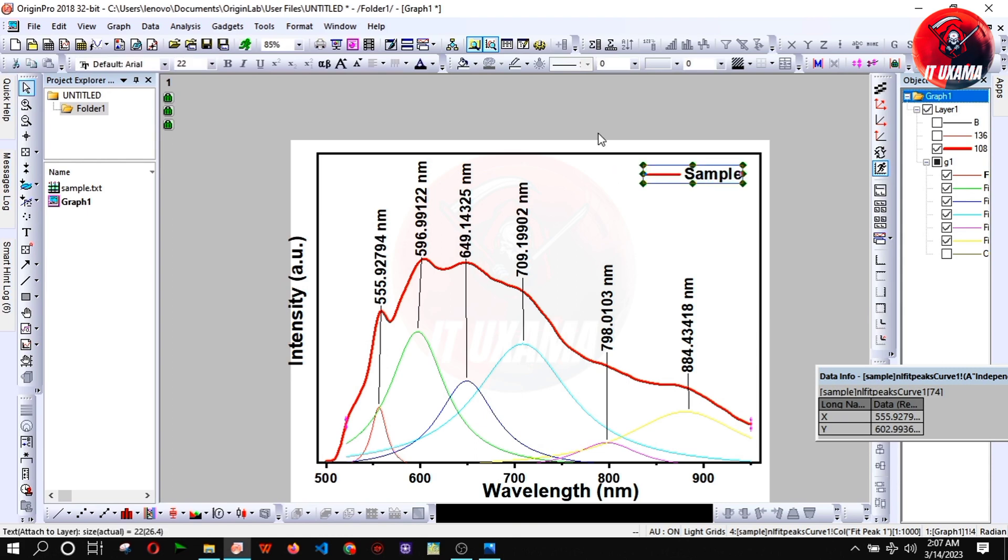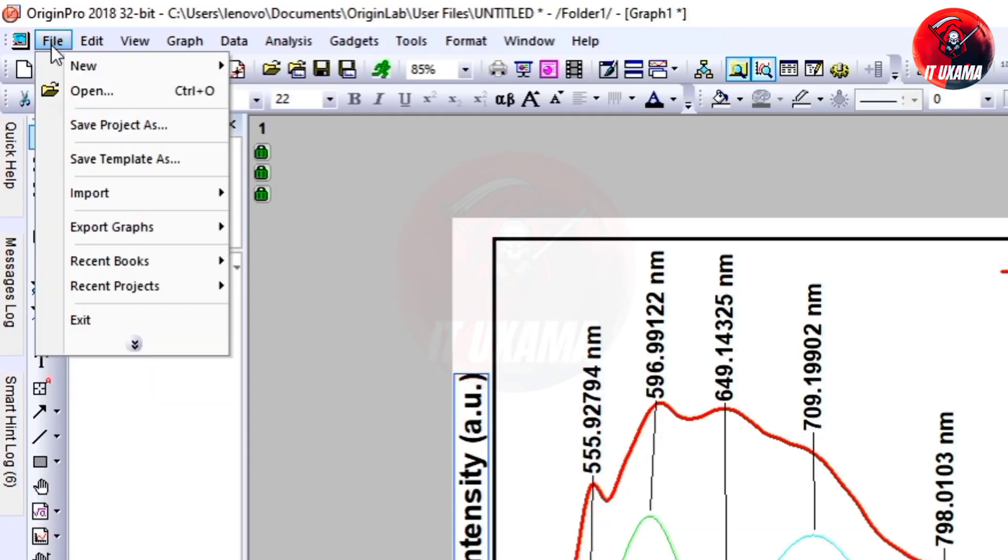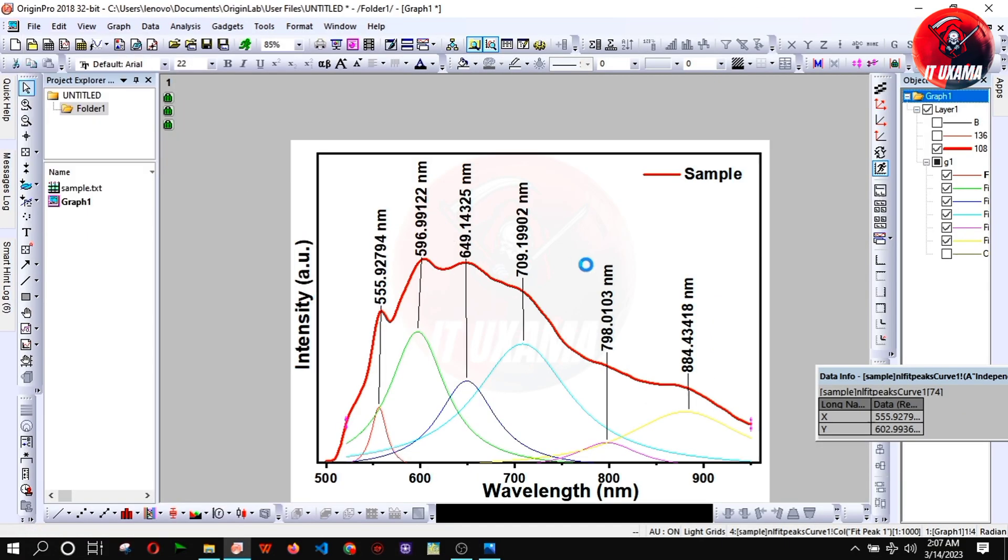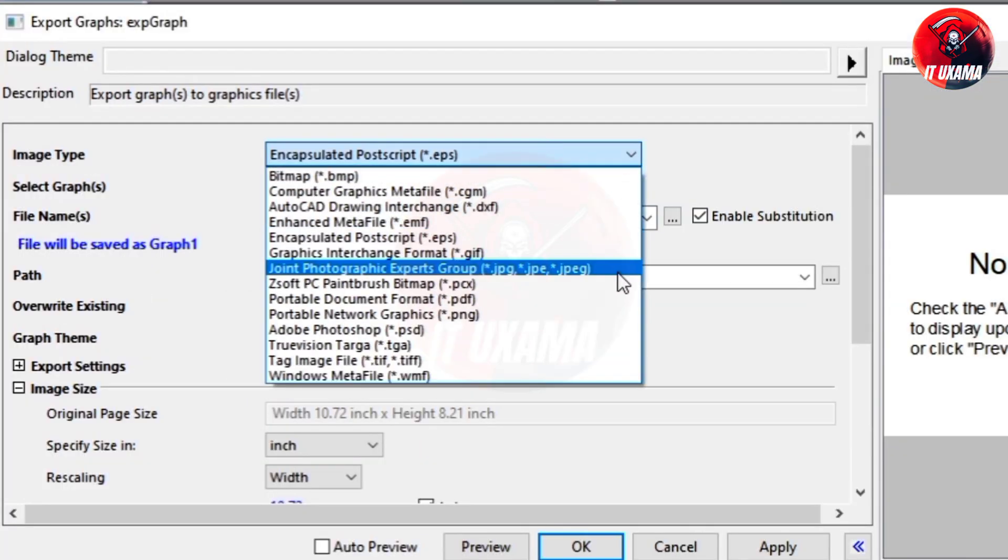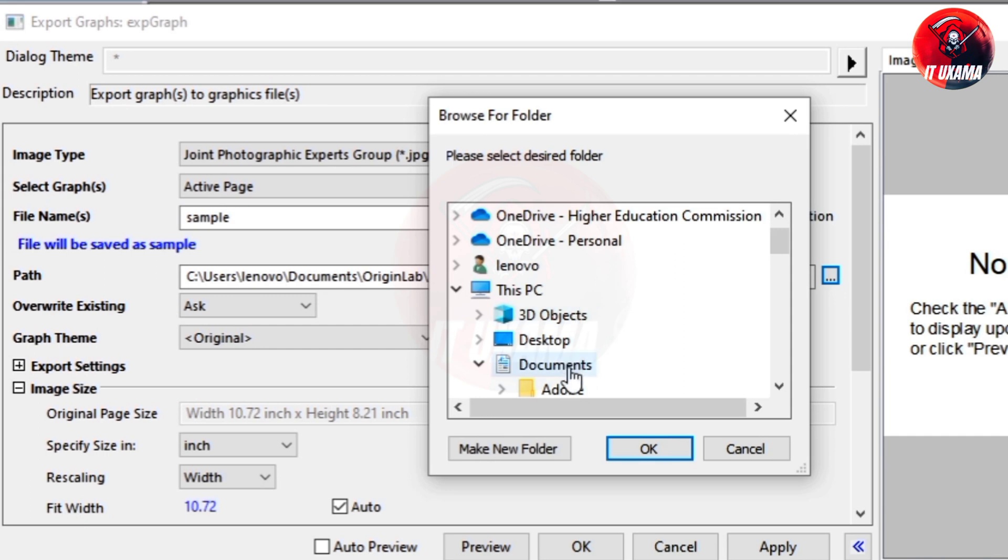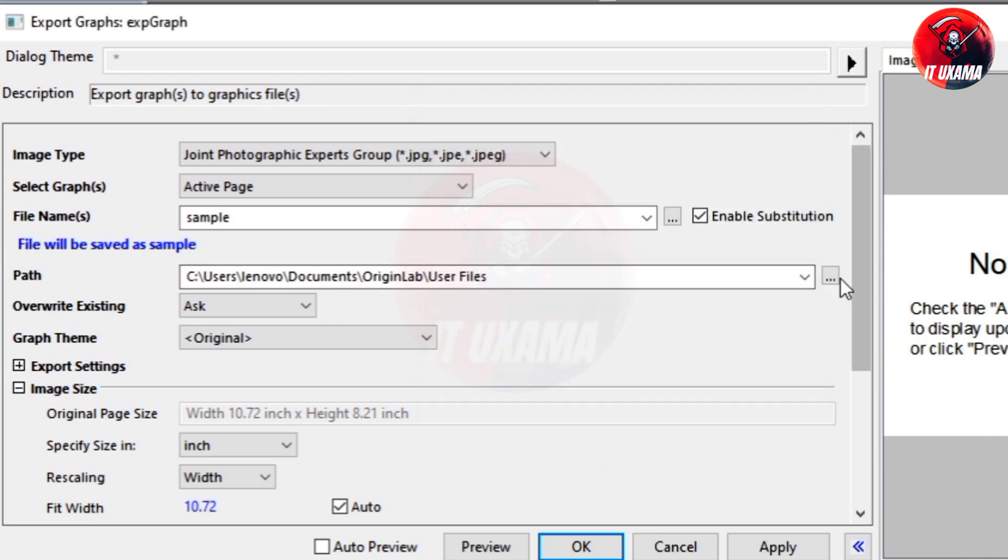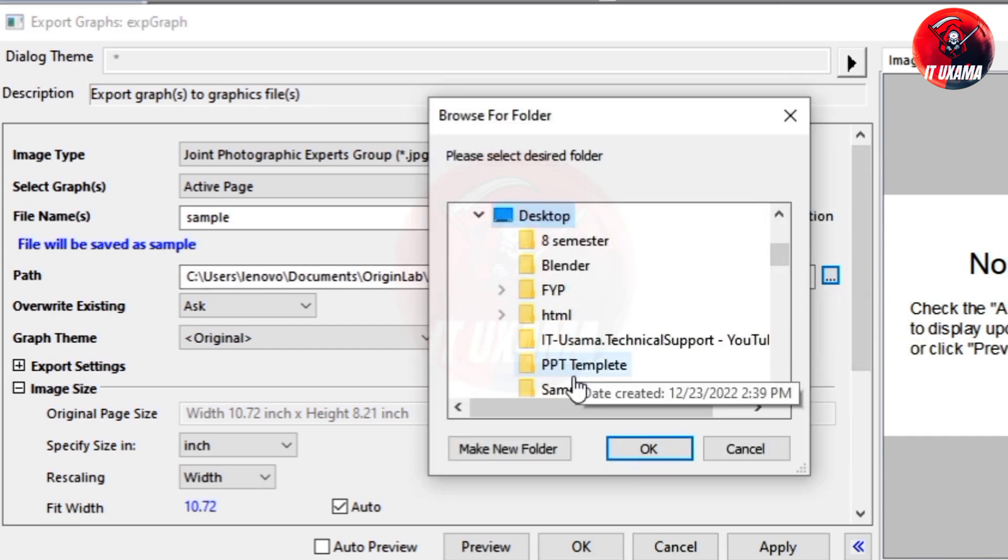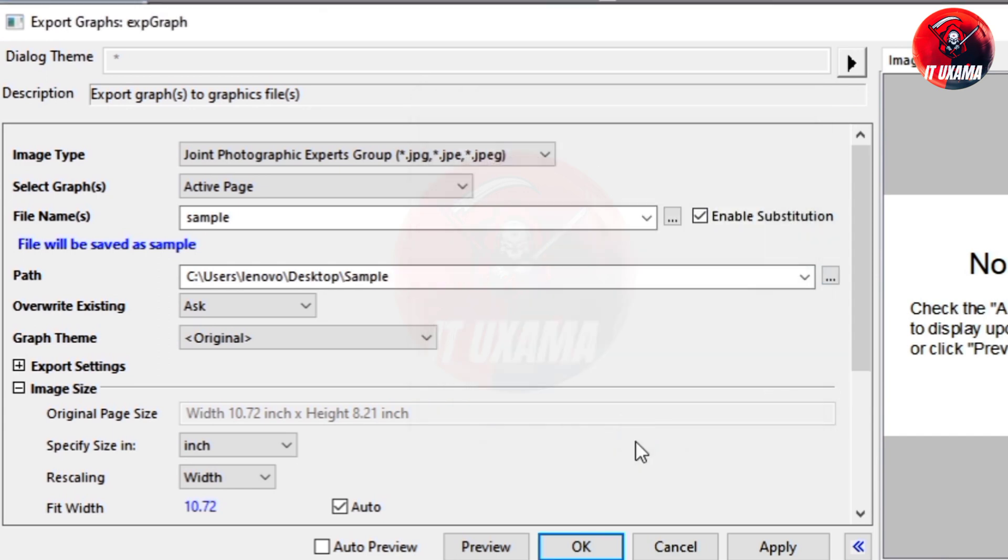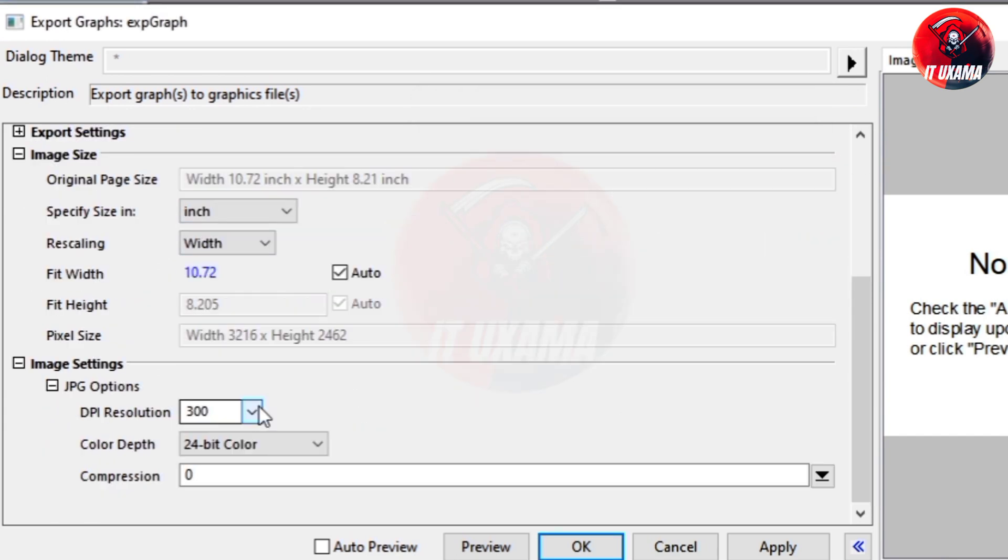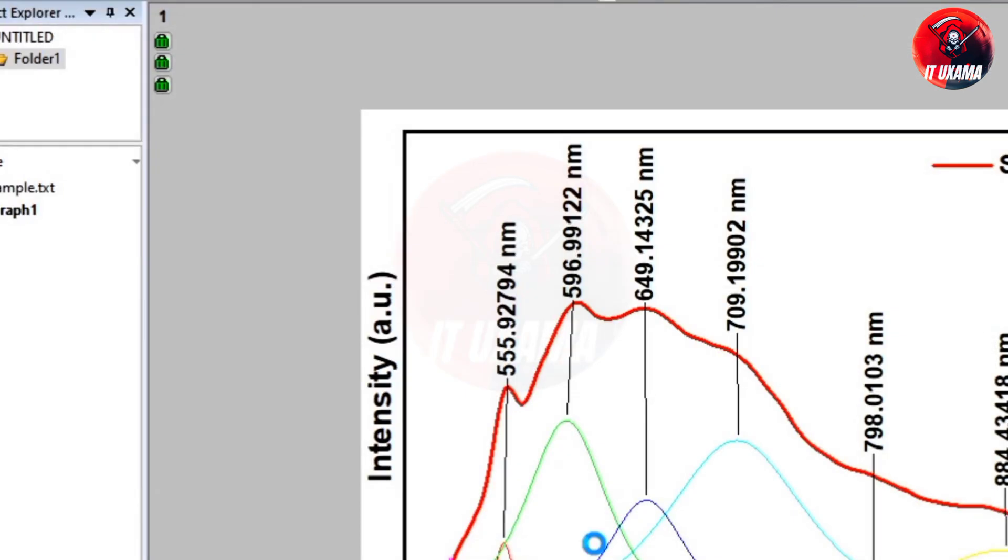You can also change the color of peaks and text according to their wavelength. In the last just go to file, export graph, open dialog. Change image type to jpg. Enter file name. Select location. Increase dpi resolution to 600. Press ok.